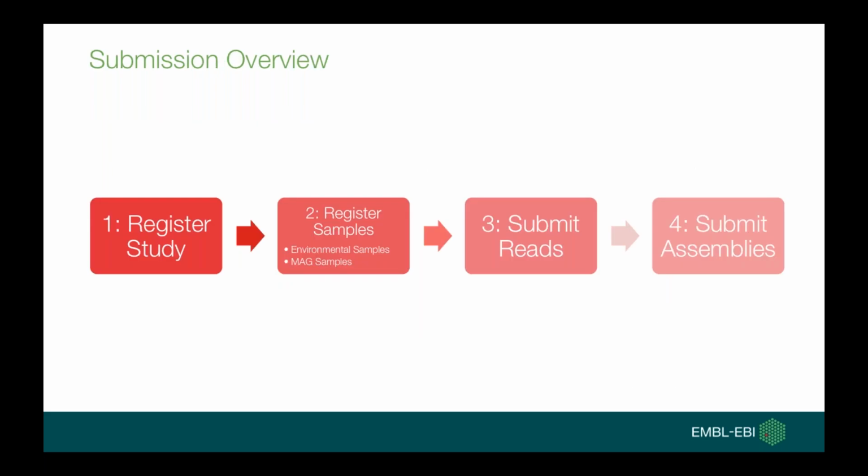We'll just run through that in overview once briefly. So the first step is registering a study. The second step is registering samples, environmental samples, and MAG samples if you need them. The third step is submitting reads. And finally, you submit assemblies.